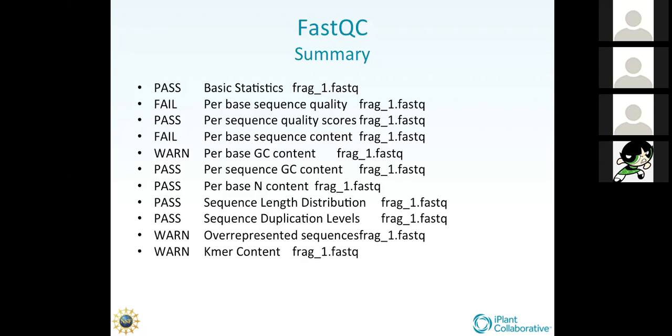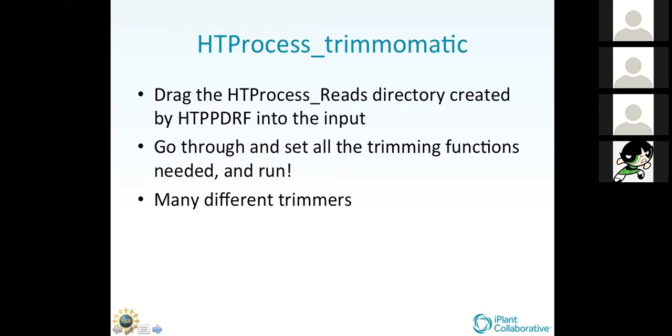And a lot of the time, otherwise, I'm guessing, just as you might, because sometimes the manuals themselves are sort of sketchy. So you have to get used to interpreting them. But that's where I can help you in some cases. You might feel that I'm better at interpreting them. Sometimes I'm just braver in how I guess. And that's what it comes down to. And as I said, if you're not sure, then try things and see how it works. And if you don't like the results, go back and run things again.